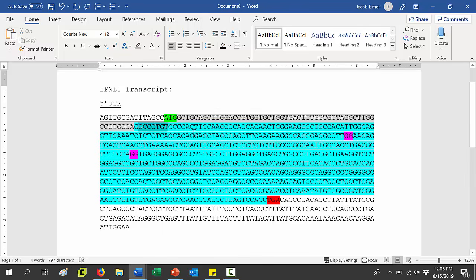So ideally, I would want to target somewhere, let's say in this first exon, after that signal peptide. And by the way, it's a lot better to make a mutation early on in the gene, somewhere up here in the first exon, as opposed to the last few exons, because early mutations will interfere with the way the protein is folding as it's being translated. This is where the protein starts to be translated. So if you can make a mutation earlier on, you have a higher chance of destabilizing that protein to where you won't see it anymore.